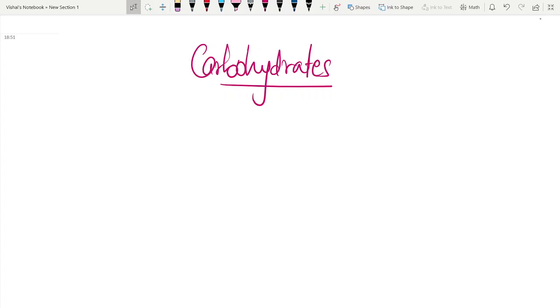In this video, we will be discussing tests related to carbohydrates. But what's a carbohydrate? Just a basic classification I would like to present here so that we can understand the ideas shared in this video easily. Carbohydrate is either a monosaccharide or a molecule made up of monosaccharides.